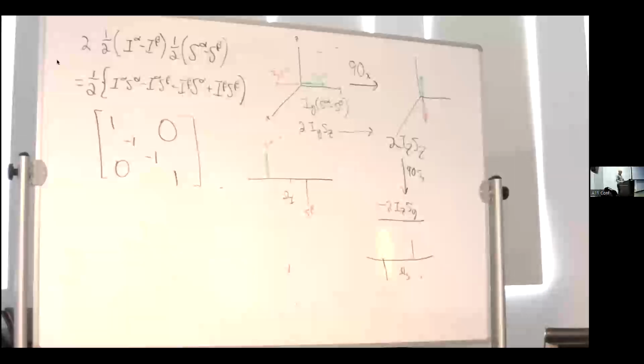Because if you go through the COSY, get the same results, identify the signs and line shapes, etc., analyzing other sequences is more or less more of the same. All the main ideas are there, basically.